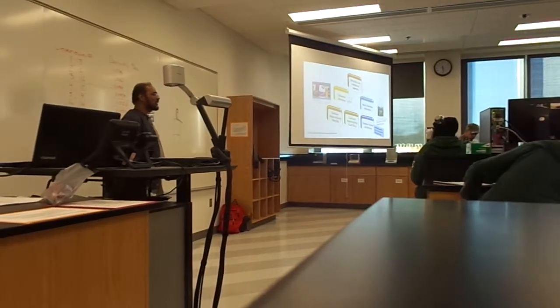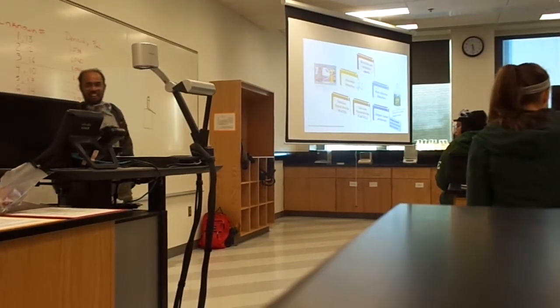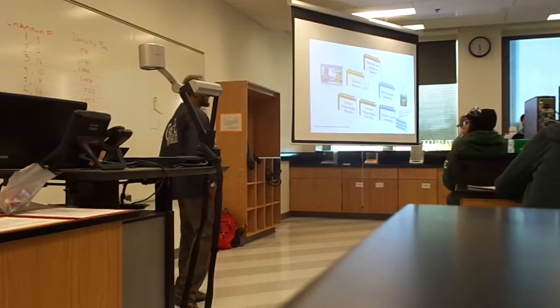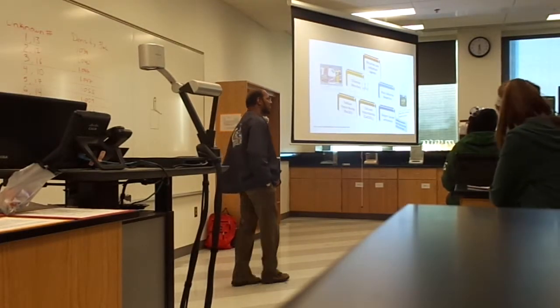Today in the lab we are going to analyze hypochlorite in bleach. Do you know anything about bleach? What's bleach actually? What are the chemical properties of bleach?